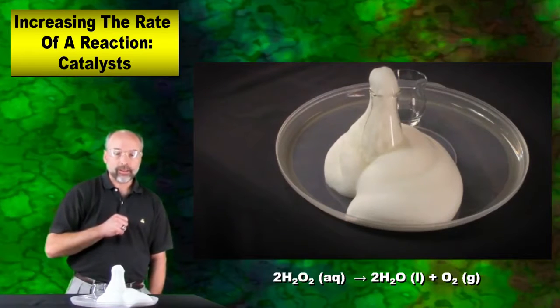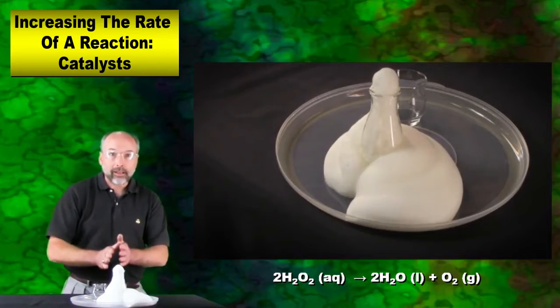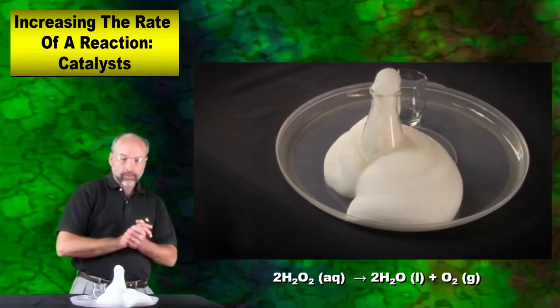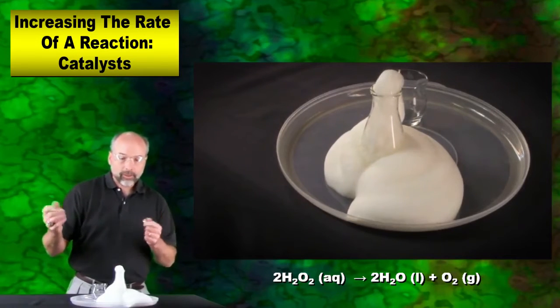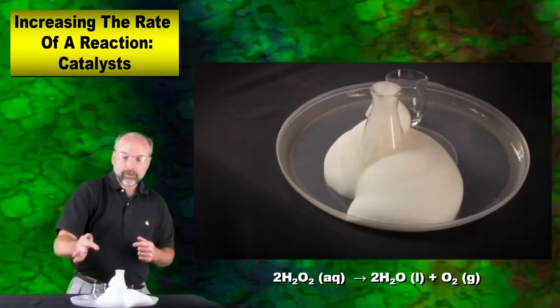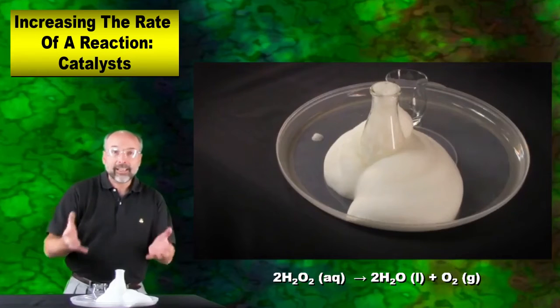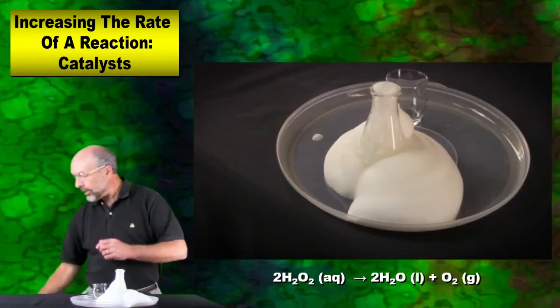Pretty cool stuff. Now the question is, is this the kind of chemical reaction where the catalyst didn't really get used up? Well, if you look at all that, you say, well, there's probably nothing left inside of here. All that yeast probably went all over. Well, what we're going to try to do is repeat it a second time. And what's kind of interesting, just putting my hand near this, it's warm. It did give off energy. It's exothermic.